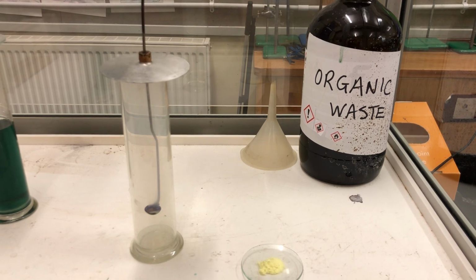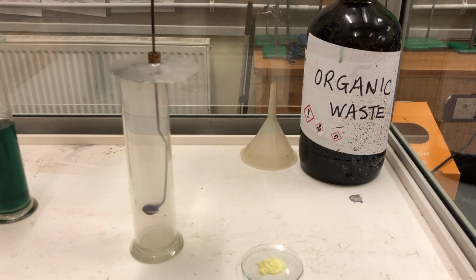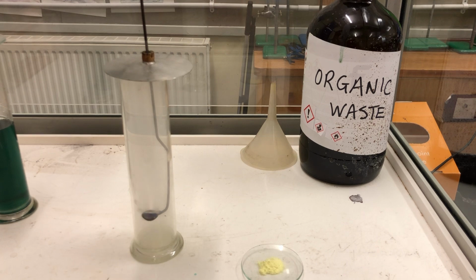I'm hoping you could see the sulfur burns with a very, very small blue flame after it has melted. It is now filling the gas jar here with a cloudy white fume. That is sulfur dioxide gas. I've had to do it in the fume cupboard because it's a very nasty gas and would affect my breathing in the lab. We're now going to show you what happens when the sulfur dioxide gas reacts with water.